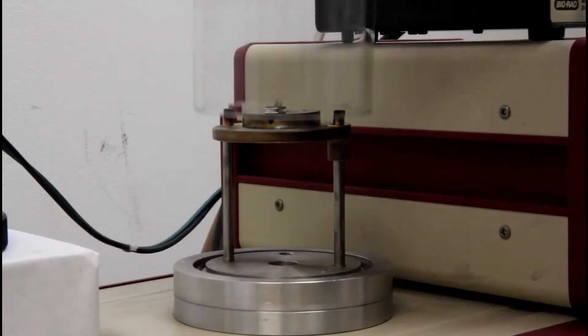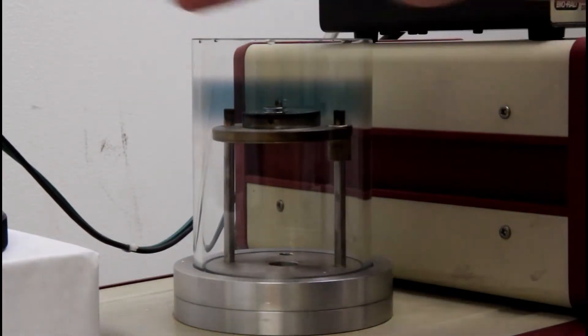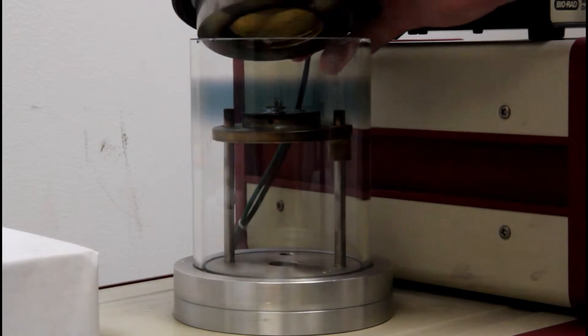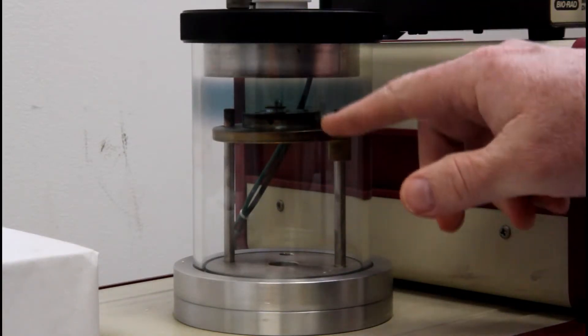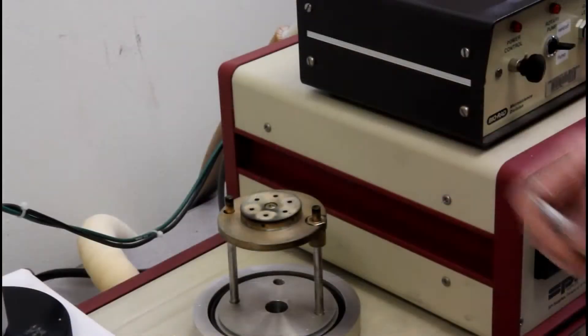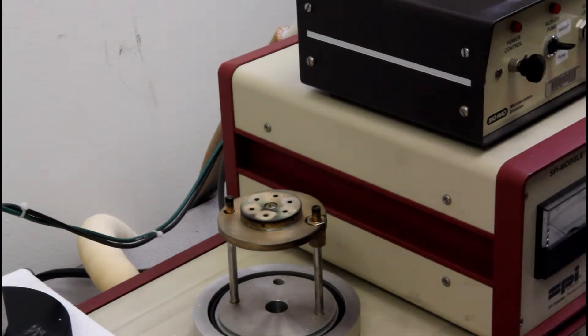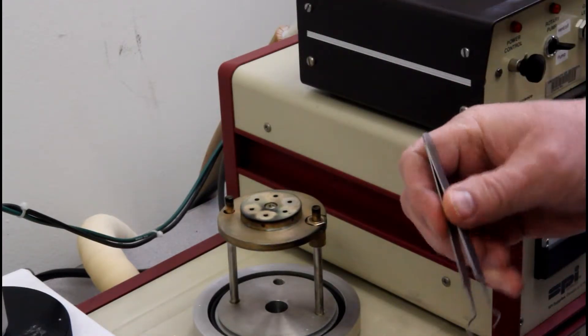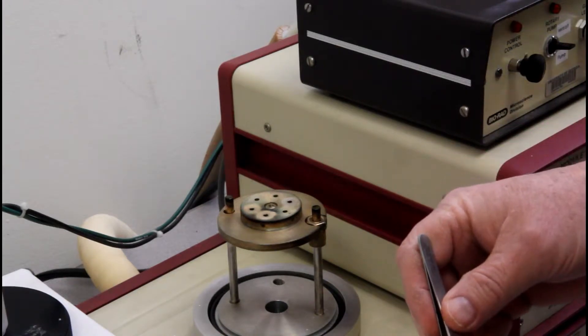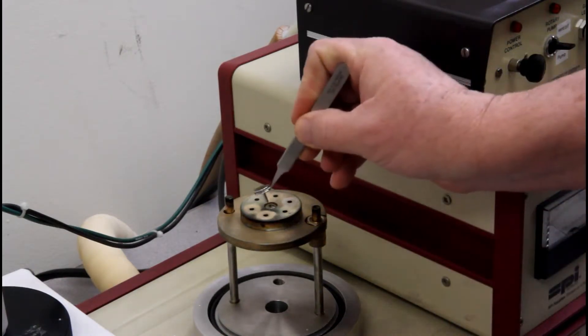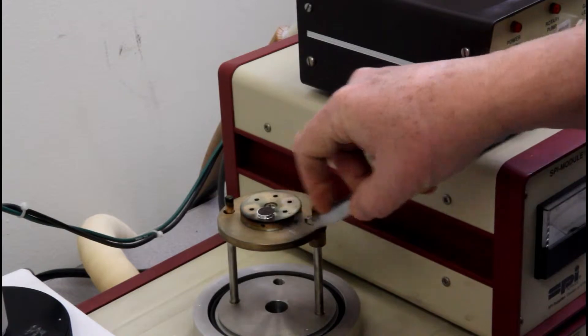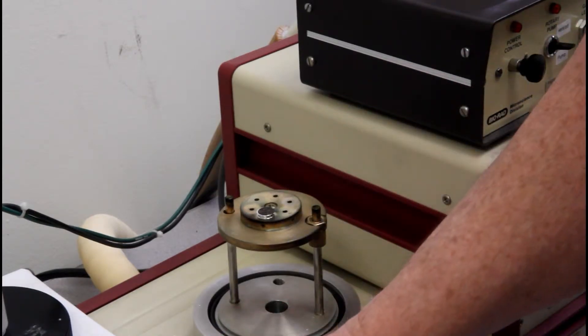Once you have it the right height, you can check it to make sure that it's the right distance away. You can see that this sputter coater holds up to six samples. So you'll want to take your sample on a stub and place it in one of these, and then carefully replace the glass.